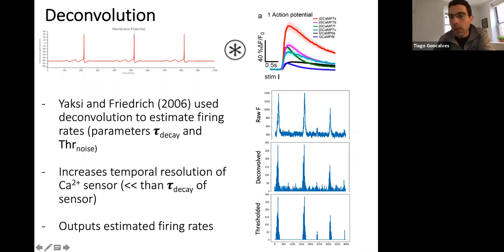But you're absolutely right. There's a bunch of viral vectors that express, say, a nuclear red fluorophore, like tdTomato nuclear, and then GCaMP in the cytosol. That makes it easier to track the cells, keep track of them, and know how many you have. But again, not having a transient from a cell doesn't mean anything, so there's no way that you can tell that a cell that never fired isn't, for example, unhealthy. That could always be a possibility.